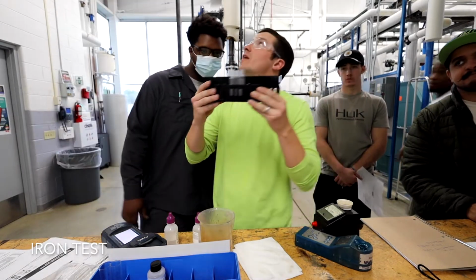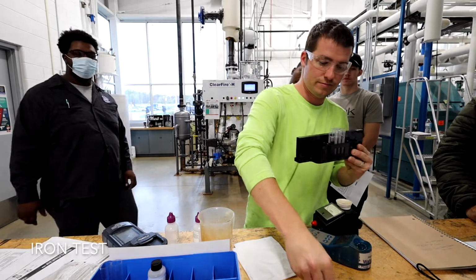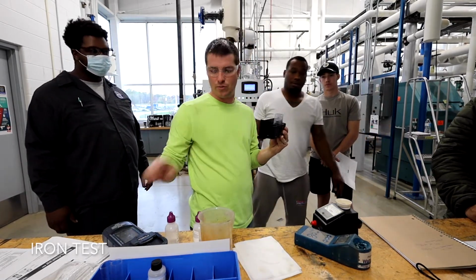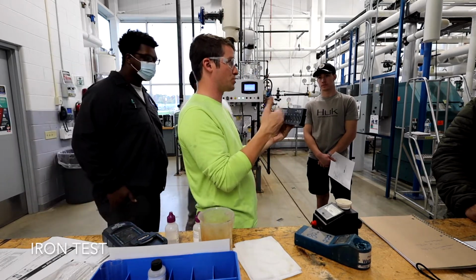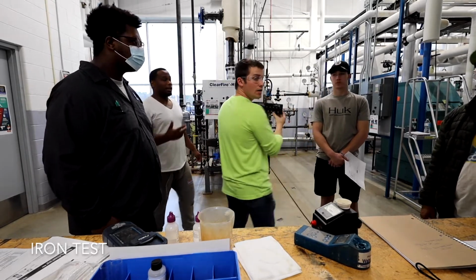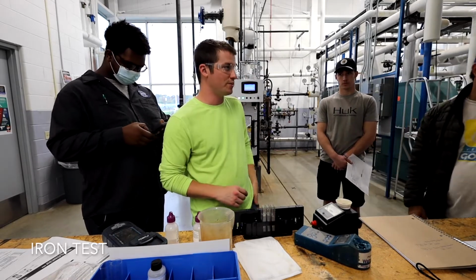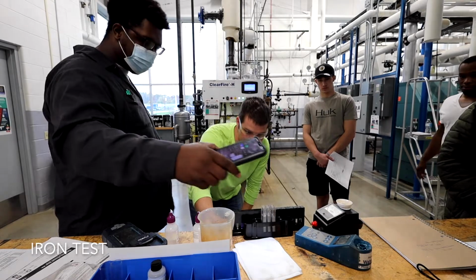Now, here's the hard part: you have to try to find good light. I would actually take this off. This is why, in an ideal world, you don't rely on this stuff anymore, because there are meters that are more accurate. This is all perception, so what I think it is might be different than whatever you think. You could use a phone, or a flashlight if you've got one. There we go. Just shine that over the top of them.